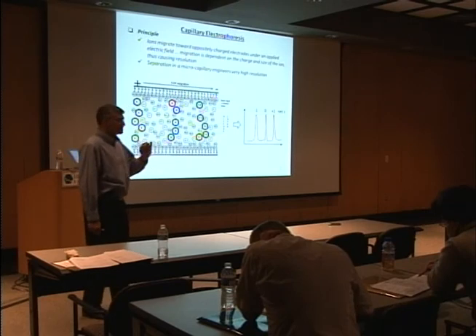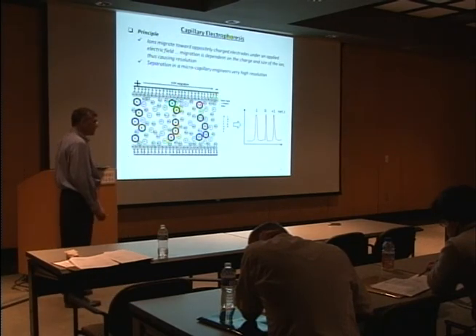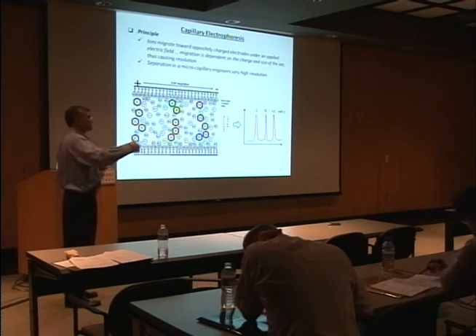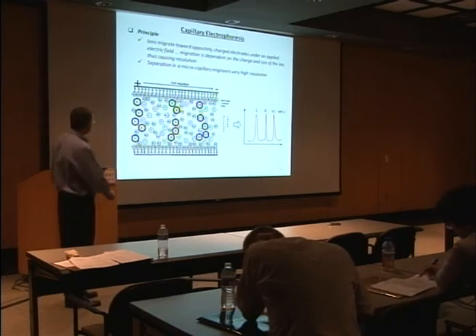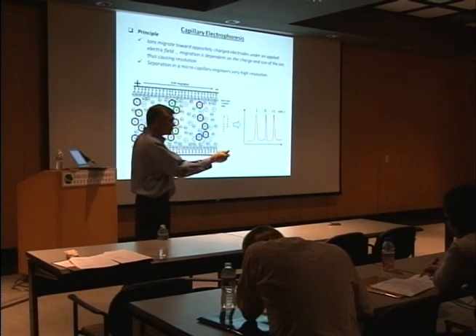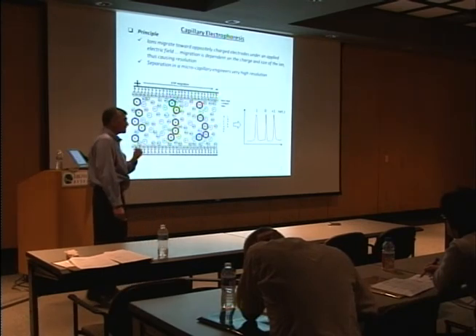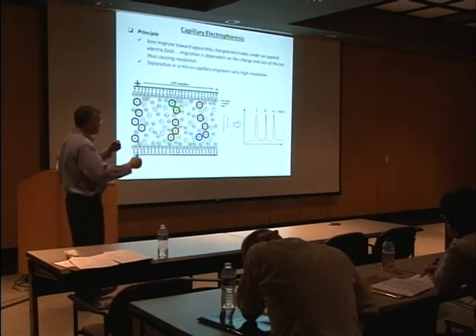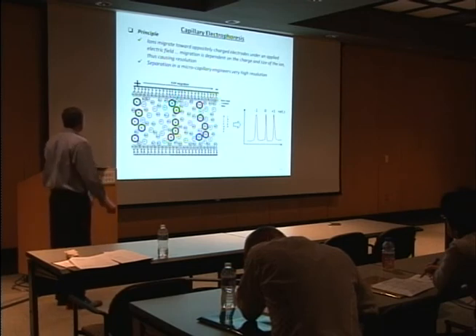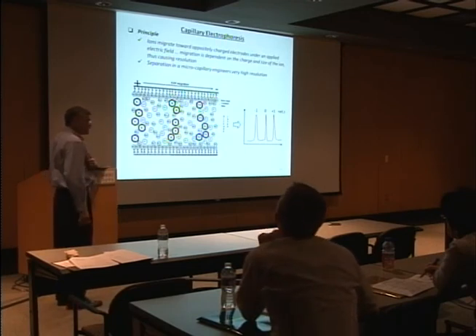So it's a really small diameter capillary, and because of this there are certain additional features that come into play, especially electro-osmotic flow. That's an additional contribution that occurs only in capillary electrophoresis and doesn't happen in traditional tube electrophoresis, which is much, much larger. By the way, it does happen in tubes also, it's just not noticeable.